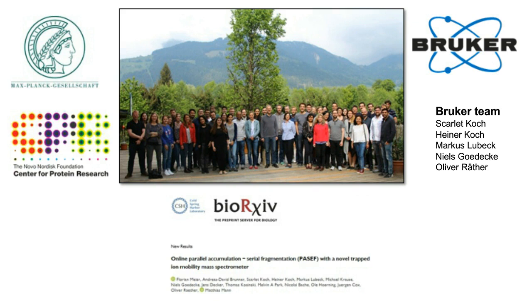Yeah, I guess one could also rephrase the question: what is the extra factor that it takes between conventional LCMS runs and TIMS runs? And so I think we are at the moment at the factor of 3. So you have to take maybe 3 times more computation time to analyze timsTOF runs compared to a conventional, for example, Orbitrap style LCMS run. But this also depends on the computing power.